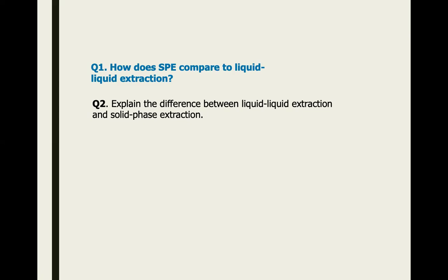But still, when you do extraction using liquid, you have to remove the solvent. The process of removing the solvent can be time consuming as well as difficult.